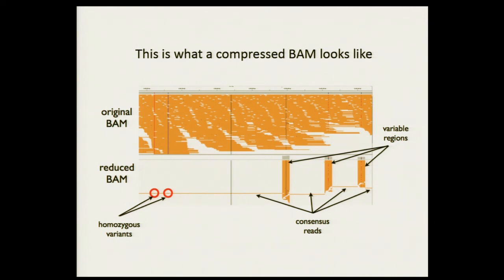And in the middle there, you'll see that there's the event. In this one, it's actually an insertion that is shared by all the reads. And this is on purpose. We don't collapse insertions unless it's 100% in every read. Here, in these two, you have just a mismatch, a SNP, a heterozygous SNP, that will then be evaluated by the UnifiedGenotyper or the HaplotypeCaller. All of these tools will be fully empowered by looking at the pile-up to make the right decision.